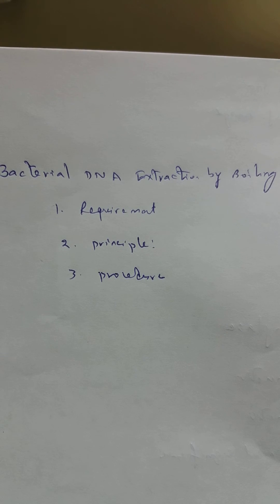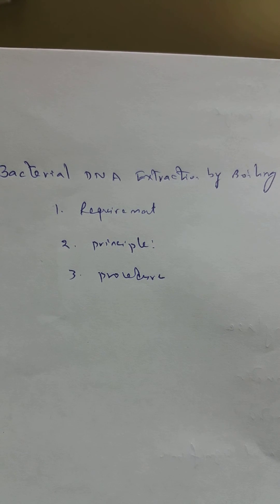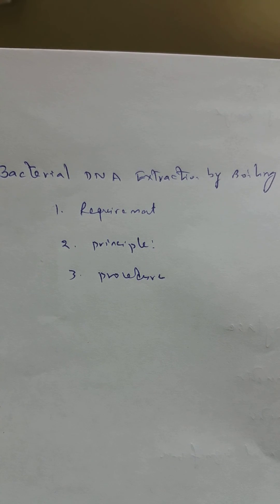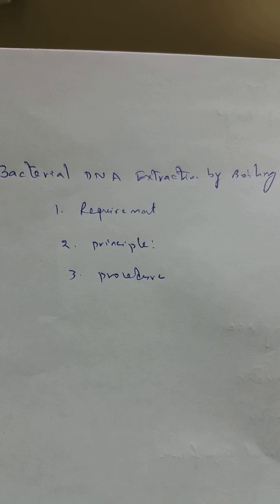Therefore, the outermost membrane of the cell is broken by very high temperature and the nucleic acid is thus extracted. For the procedure: take a micro centrifuge tube, add 100 microliters of distilled water into it, add a few colonies of bacteria from a bacterial plate, mix it thoroughly, and keep it at room temperature for about five minutes.